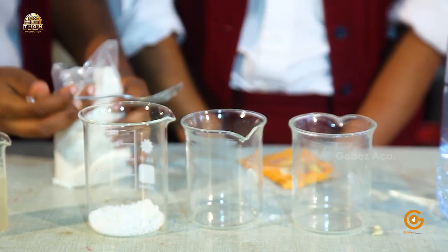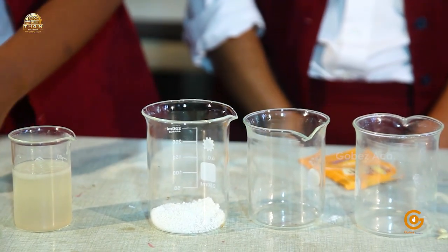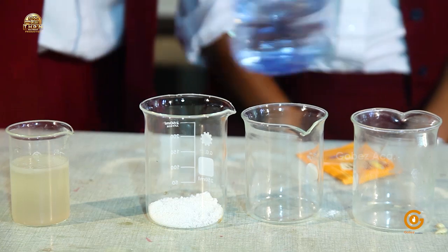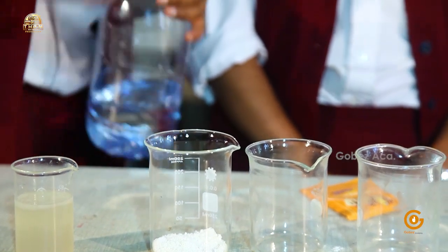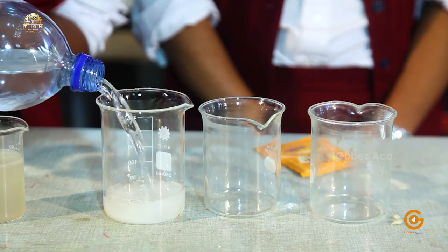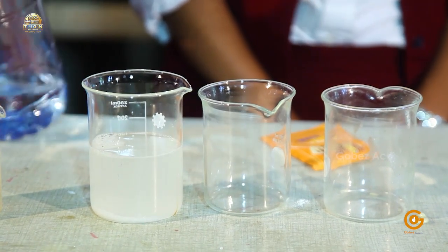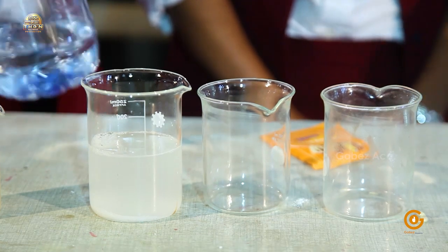So I'll add an equal amount of water to prepare. That's about enough, I think.